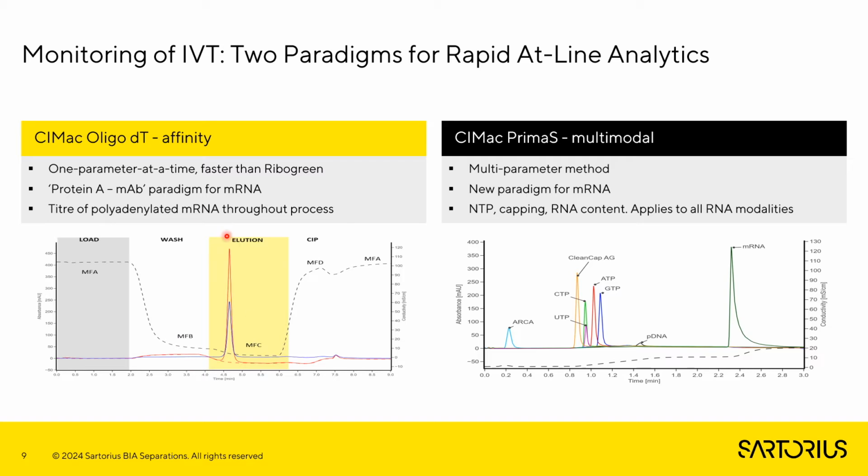This method is very akin to the protein A ligands in the monoclonal antibody field. So it provides us with a fast analytical method with only one caveat: the fact that it gives us only a single parameter, only a single output for the analysis.